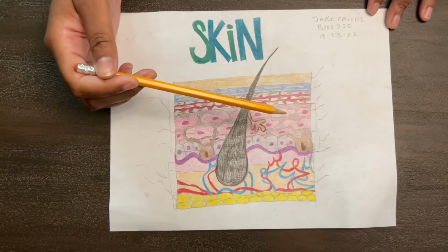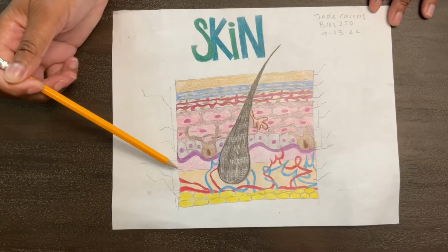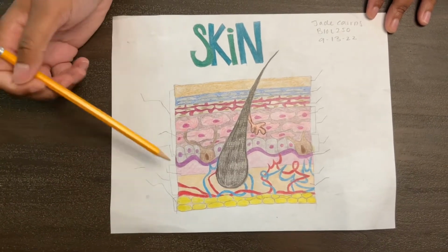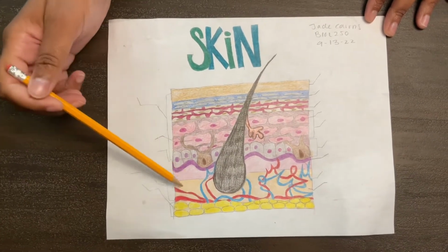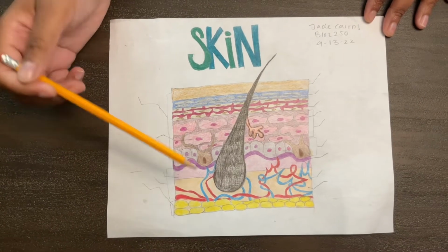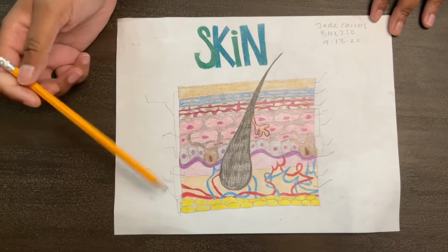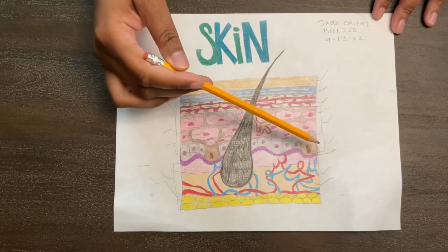The papillary layer is right here, and it is a superficial layer that is the loose connective tissue that is highly vascular. The reticular layer is this region here, and that is the deep layer and has the dense connective tissues. The stratum basale is this area here of the layer.